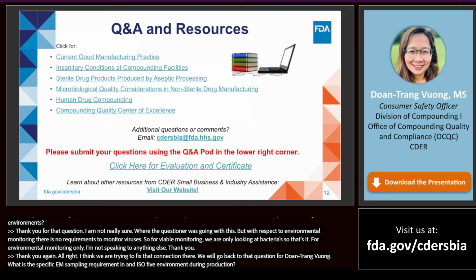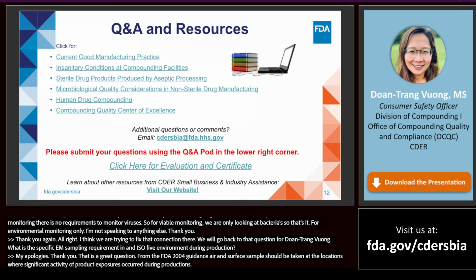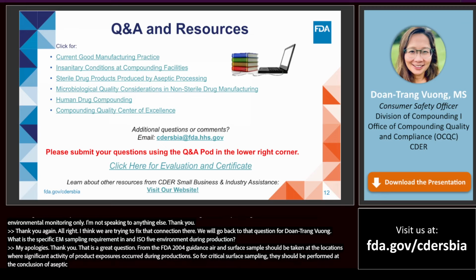My apology. Thank you. That's a great question. From the FDA 2004 aseptic guidance, air and surface samples should be taken at the locations where significant activity or product exposures occur during production. For critical surface sampling, this should be performed at the conclusion of aseptic processing operations to avoid direct contact with sterile surfaces during processing. However, the sampling should be performed prior to cleaning.